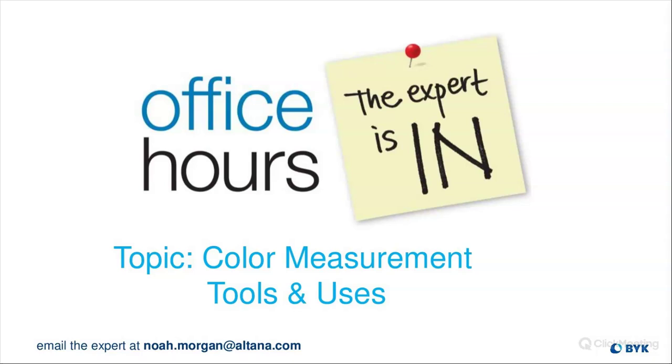Your LAB scale is basically your color coordinates. So they'll match up with other instrumentations and other standards that you're going off of. But the reflectance curve is what you really want as far as the accurate data that it can gather. And that's where the digital standards come in. Yeah, exactly. And you mentioned the spectral curves earlier in your presentation. That's the fingerprint of a specific color. I love that term you use.